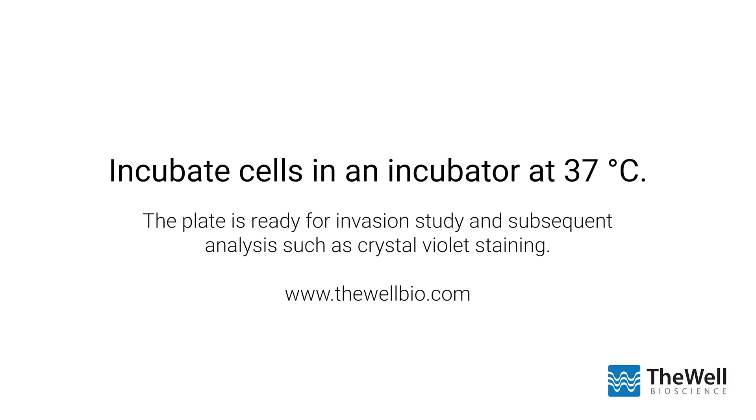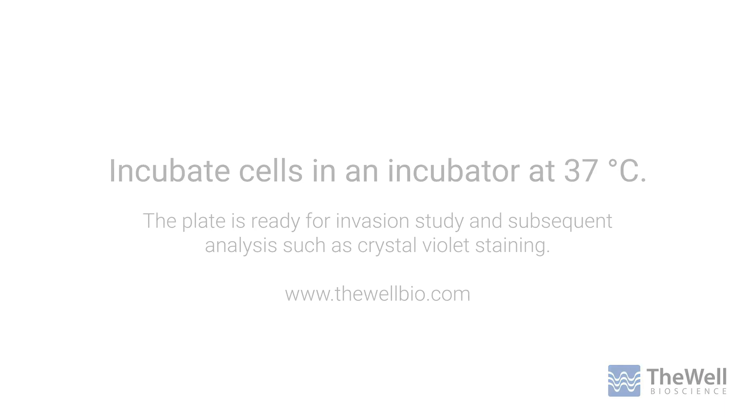Lastly, incubate the plate in an incubator at 37 degrees Celsius. The plate is ready for invasion study and subsequent analysis, such as crystal violet staining. Learn more about Vitrogel Hydrogels and other products for 3D cell culture applications at thewellbio.com.